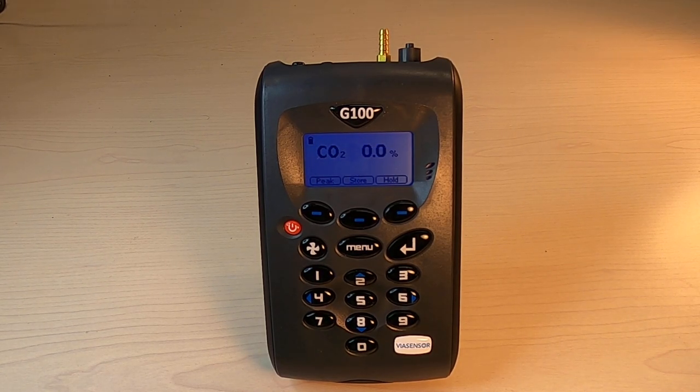Hey everyone, this is Shane with Diamond Scientific, and in this video I'll just be demonstrating a quick run-through on taking a reading with your VIA Sensor G100 model.